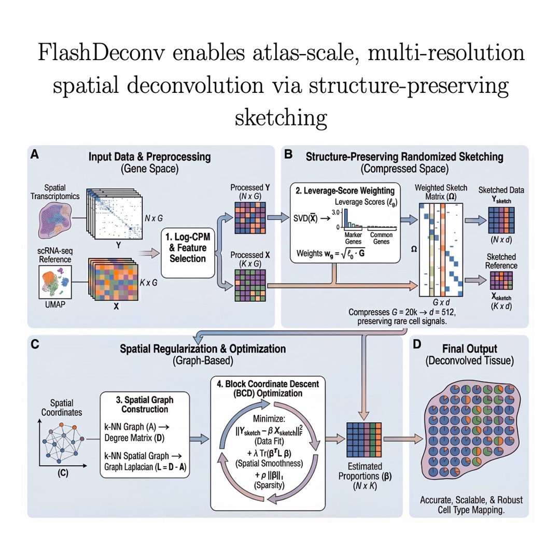Meanwhile, you have the rare cell types. Maybe cancer stem cells making up less than 1% of a tumor, or these really specialized immune cells. Their unique molecular signal gets lost, because their population is just too small. They're mathematically quiet. And so variance-based methods systematically underweight them. They filter them out. So it's that classic paradox. The thing that's rarest is often the most important, but it's the first thing we accidentally throw away.